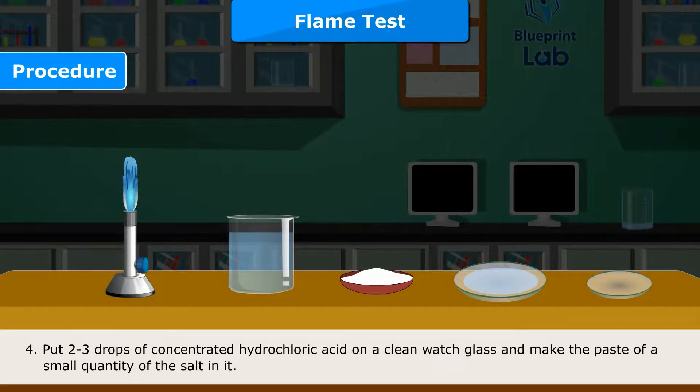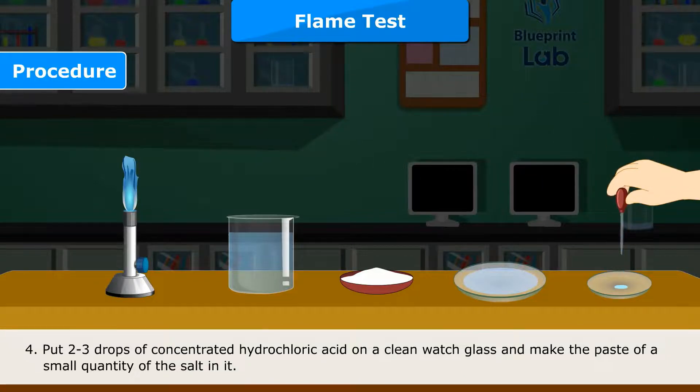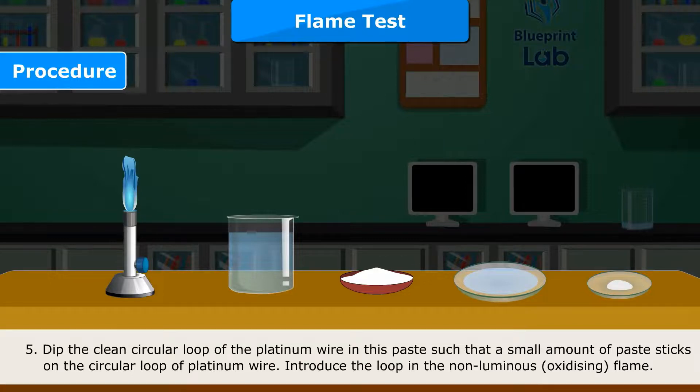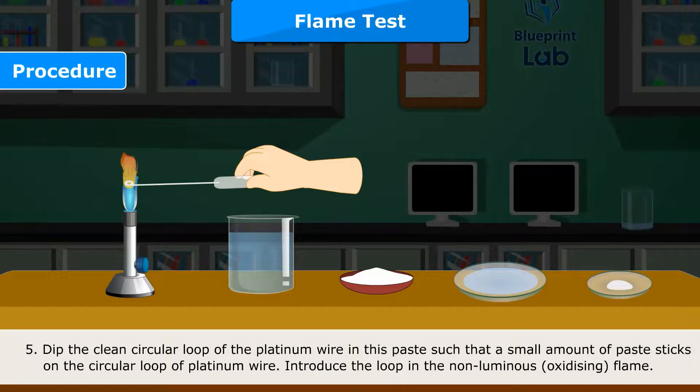Step 4: Put 2–3 drops of concentrated hydrochloric acid on a clean watch glass and make a paste of a small quantity of the salt in it. Step 5: Dip the clean circular loop of the platinum wire in this paste such that a small amount of paste sticks on the loop, then introduce the loop into the non-luminous oxidizing flame.